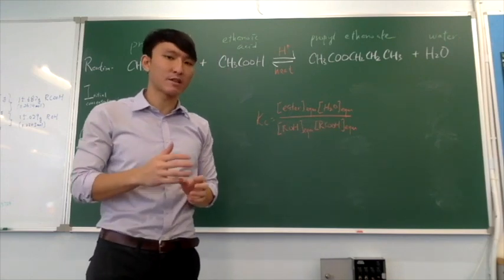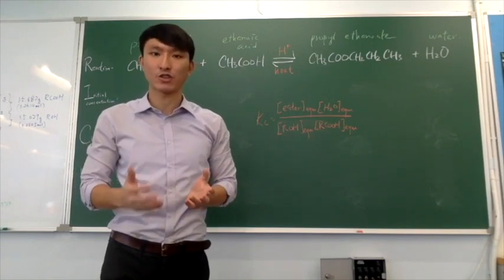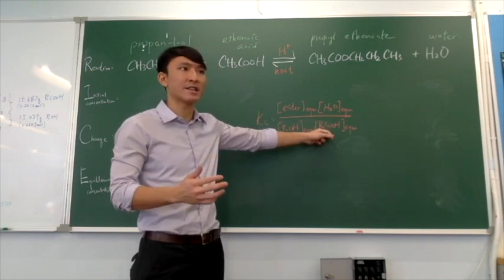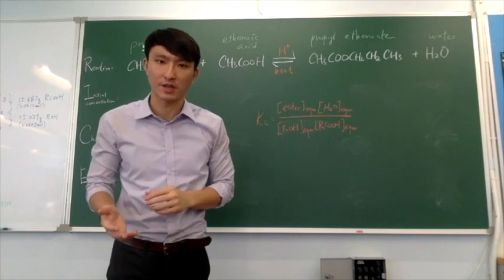And we try to find out the concentration of acid using, of course, an acid-alkali titration. So we are going to titrate the ethanoic acid in the mixture using standardized sodium hydroxide solution.